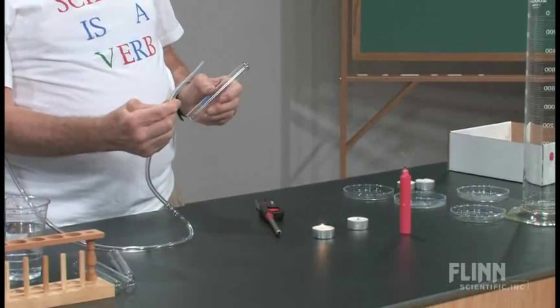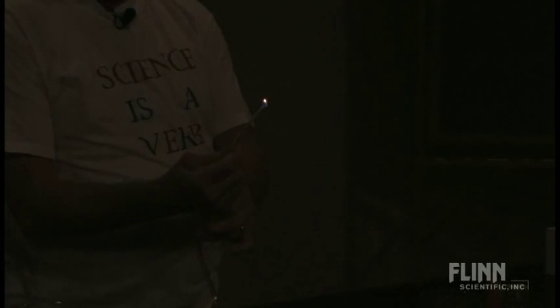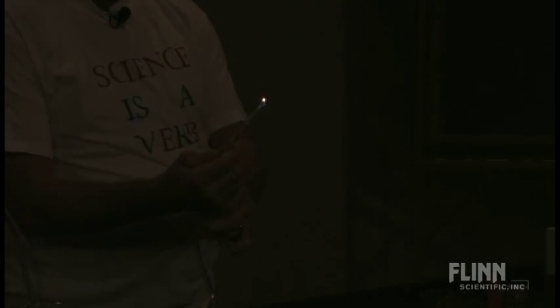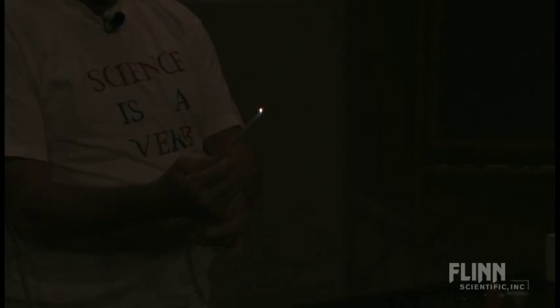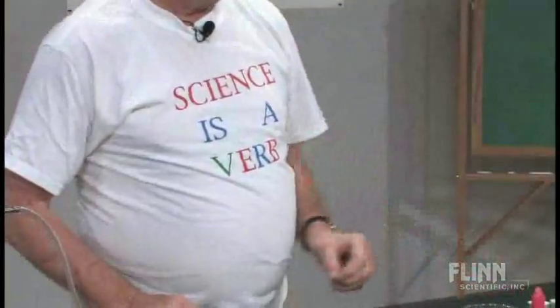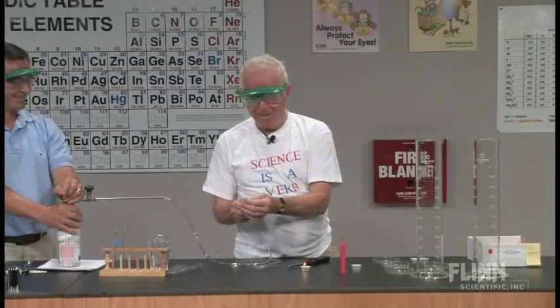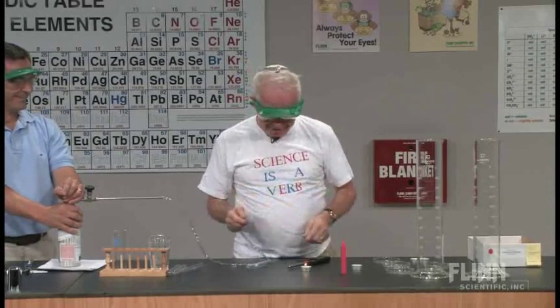Lights dimmed. Turn it off please. Notice I'm pinching it as well. Turn it right off at the main valve. We'll do that once more in a slightly different way. Whenever you see... I just melted the tube here — you've got to be careful of that too.